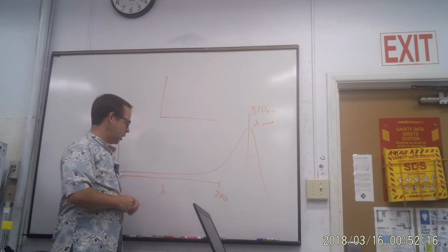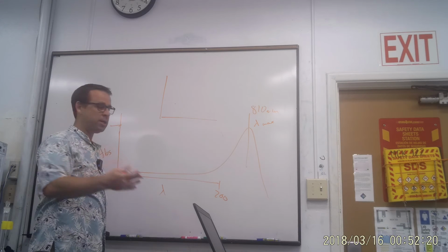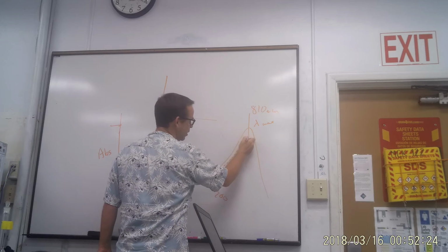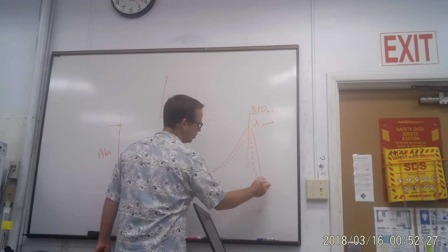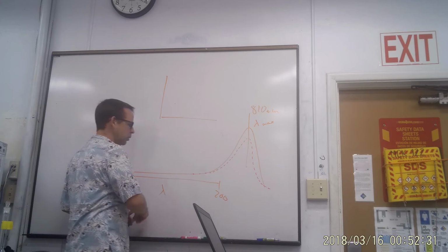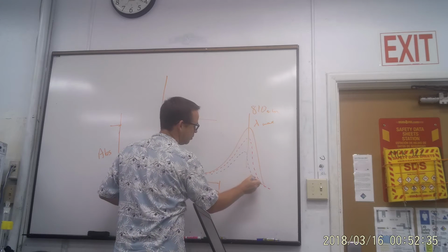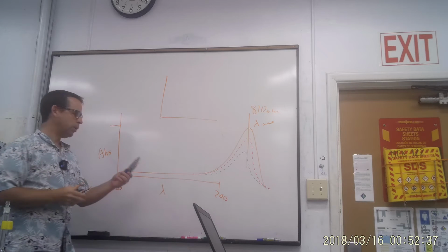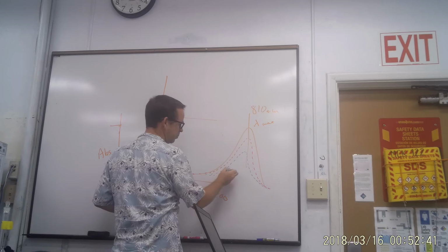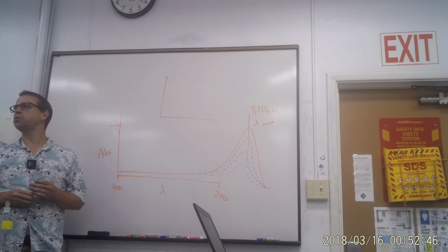Okay. If I have a different concentration of this same material, it's been diluted now, right? Then I'm going to get a curve that looks something like that, right? And a lower concentration yet. What do I do with this set of curves after I have all these curves? Why would I gather all these? What would all these do for me?